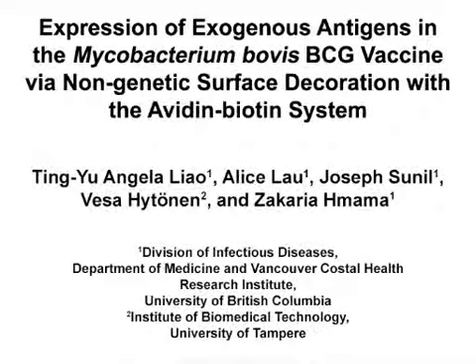The overall goal of this procedure is to express surface proteins on Mycobacterium using surface decoration with recombinant proteins as an alternative to traditional genetic-based approaches. These methods can help address important research questions in the field of mycobacteriology, especially in the area of host-pathogen interactions and vaccine development.